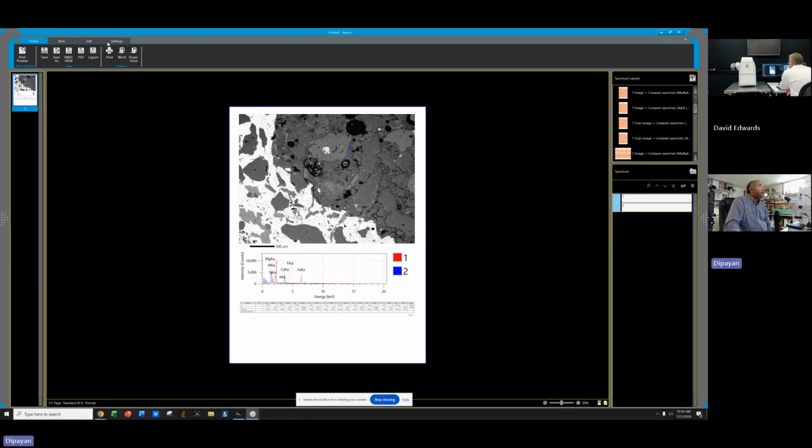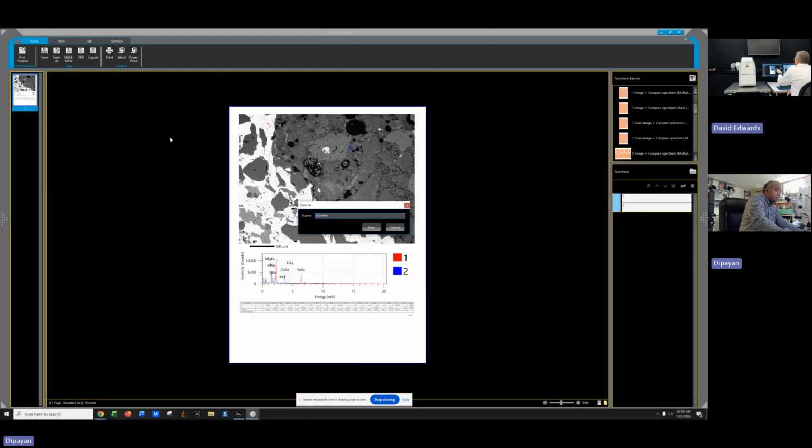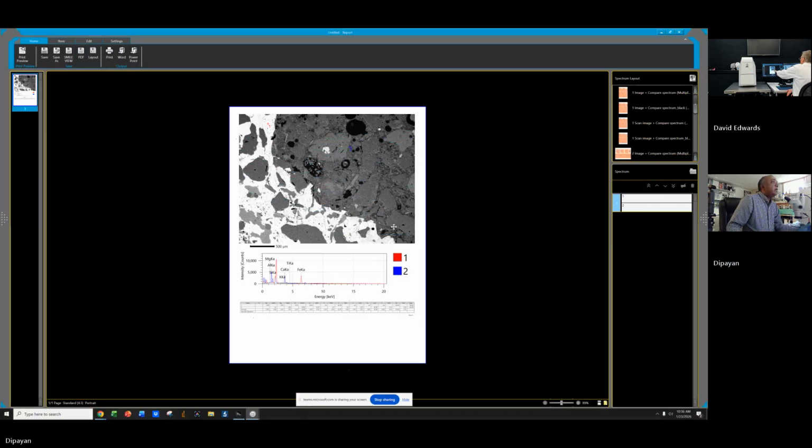Yeah. And then I have to save it. I don't know if I need to save it here. I save with the same name. Yeah, don't save the template. There's no need to save this. Okay. There is no need to save that. I straight go to PowerPoint then. Yeah. And then I save it to my hard drive.